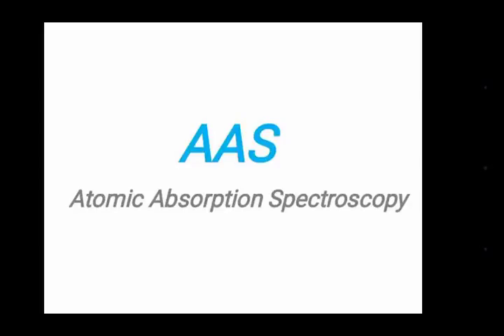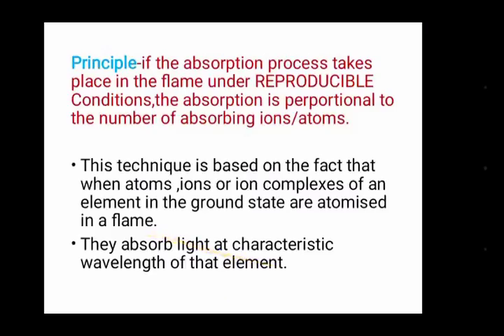Atomic Absorption Spectroscopy, AAS. Today we're going to learn about atomic absorption spectroscopy. First of all, we discuss its principle.